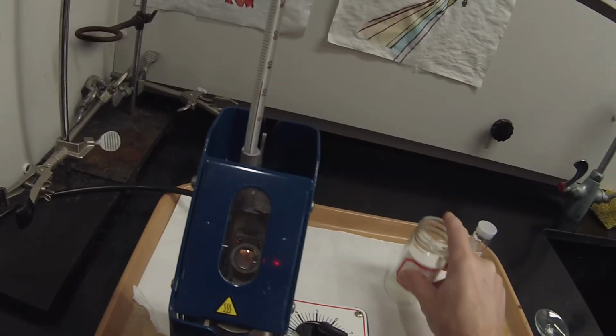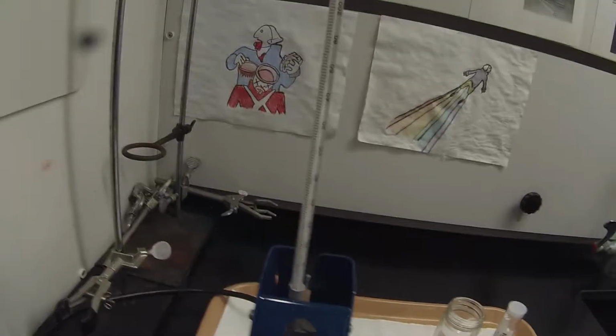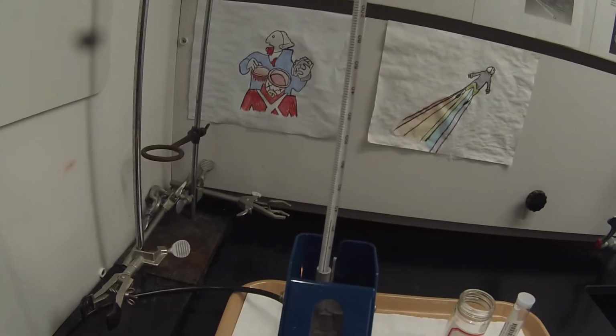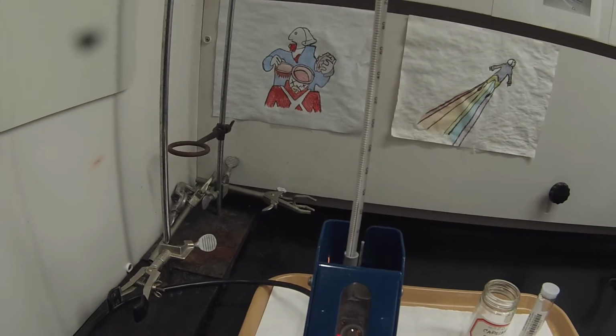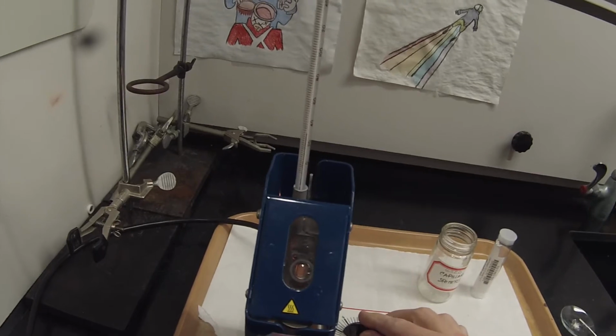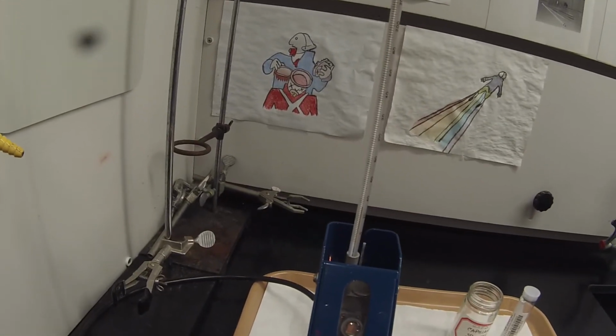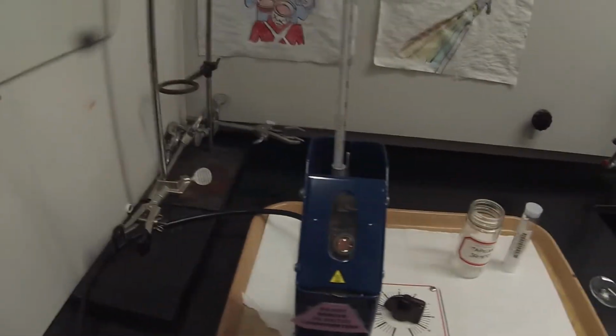Unfortunately, I don't have 2 cameras, so I can't set one looking through the magnifying glass and the other one looking at the top, which would be optimum. So this thermometer is a 400-degree thermometer. And we should see it start to rise fairly quickly at some point. I'm going to leave that there, because I may need to run it again if it melts too quickly. But it looks good in there at the moment.